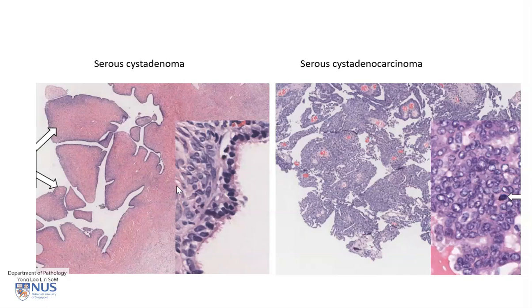Microscopically, the serous cyst adenoma again shows a lot of fibrous stroma, and we can see these columnar ciliated cells which only form a single layer. As opposed to the serous cyst adenocarcinoma with these extremely complex papillary formations — you can see very slender papillae here — and at a high magnification view, there is marked nuclear atypia as well as frequent mitotic figures, as you can see one here.